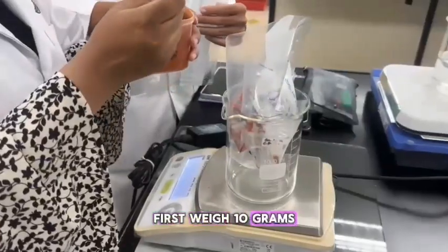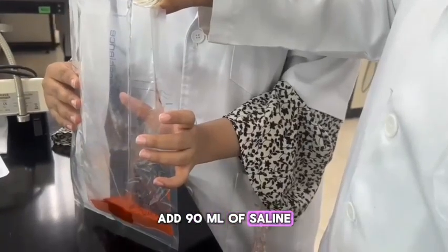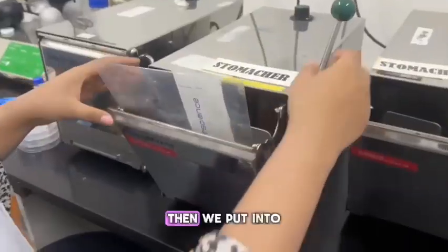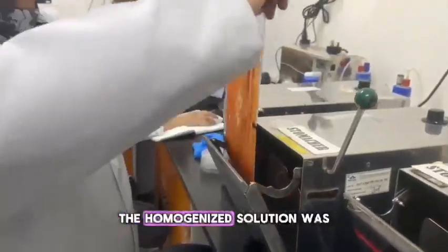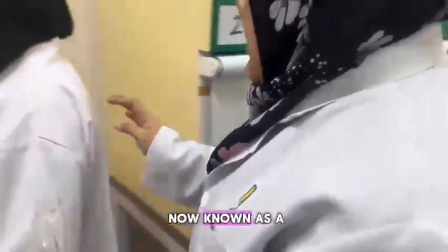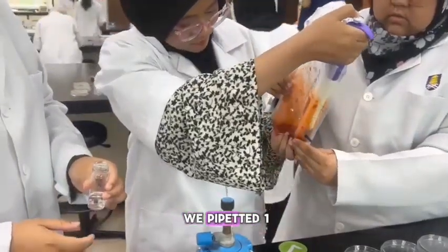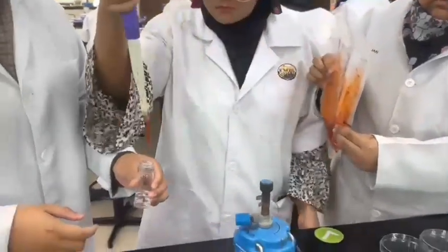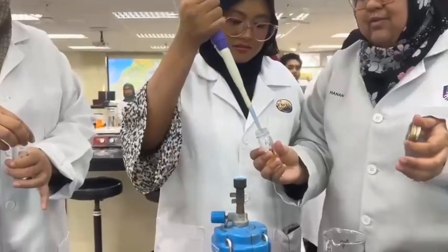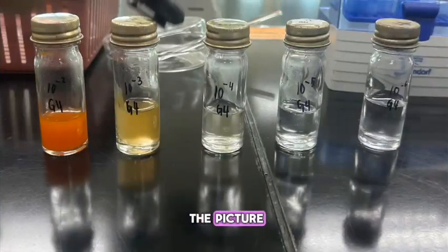First, we take 10 grams of spice sample. Add 90 ml of saline. Then we put it into a stomacher to homogenize the sample. The homogeneous solution is now known as the first dilution. From the first dilution, we pipette 1 ml to create the next dilution. We create the serial dilutions as shown in the picture.